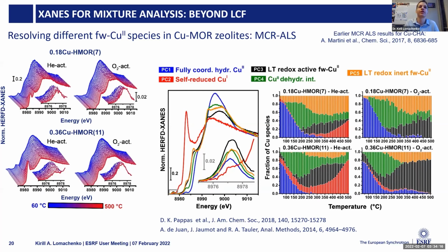Of course, there are some constraints that we can put on the fit, like we can constrain the spectra to be not negative. We can constrain the sum of the weights to be equal to 1. But as for the rest, it is up to you. So it cannot be a first thing that you do to study your sample. You need to have some prior knowledge.